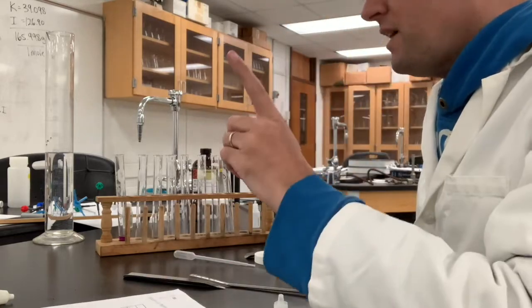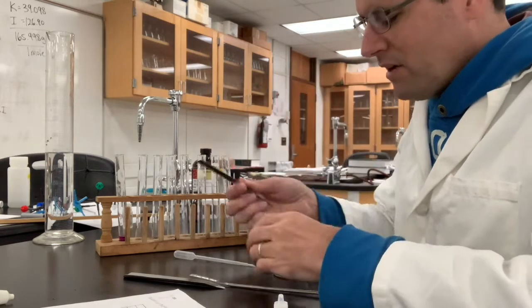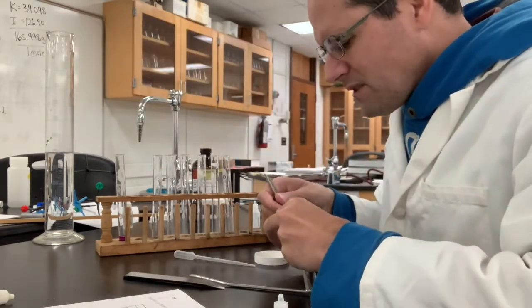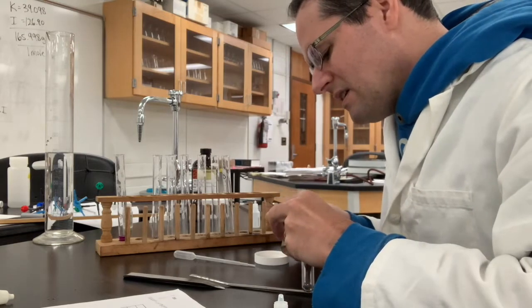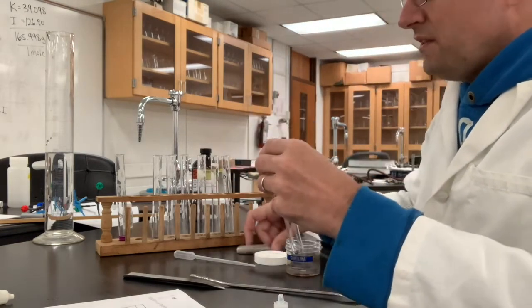Now I'm going to skip over to the second column. I'm going to do the same thing in cyclohexane, so we have a side-by-side comparison. Let's grab a test tube and add just the smallest little pinch in there.